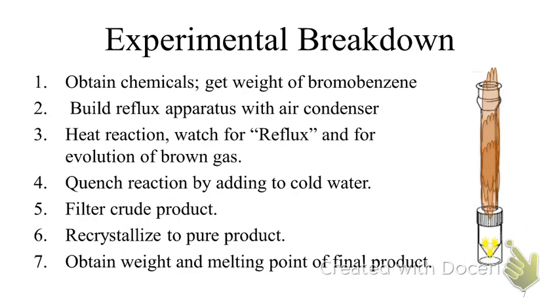Once you're done with the reaction, you'll quickly add it to water once it's cool to the touch. You'll collect your crude product. You then have to recrystallize. If you don't remember recrystallization, this is a pretty important procedure, so you'll need to go back and review your technique. You'll obtain the weight and melting point. With the melting point, you'll be able to identify which compound you actually obtained, and you can then complete the rest of the post-lab assignment.